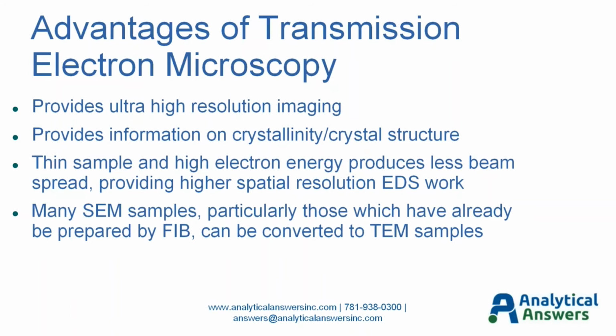So we get very little spread within the sample, and we can provide high spatial resolution EDX work. And one thing I may not have pointed out specifically up to now is that many SEM samples, and particularly those which have been FIB prepped for the SEM work, can be converted to TEM samples if we see something in that initial SEM analysis that we'd like to examine in greater detail.